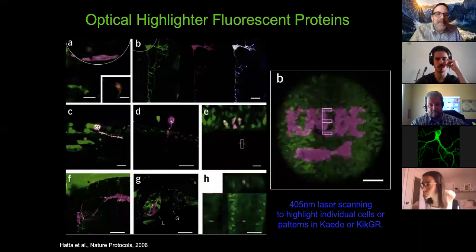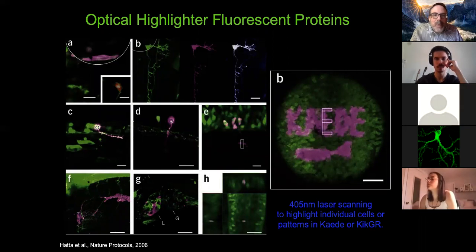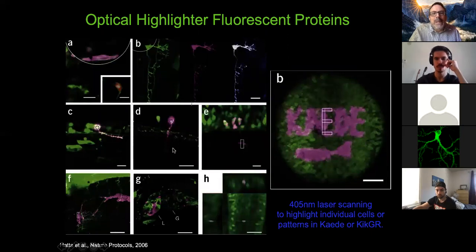This is a paper not from us, but in zebrafish, in which they used a Kaede expressing line and were able to show that you could basically at will identify cells for highlighting, shine a 405 nanometer laser UV light onto the cell of interest and convert it to red. And so single cell morphology can be extracted in this approach. The problem with using 405, obviously, is that you don't get the nonlinear optic advantages of single plane targeting, which may be important for this kind of approach, but you get the idea.